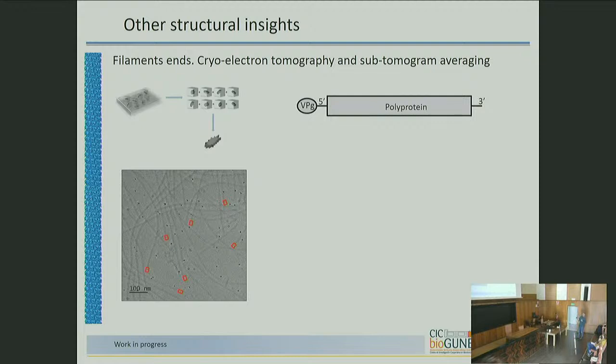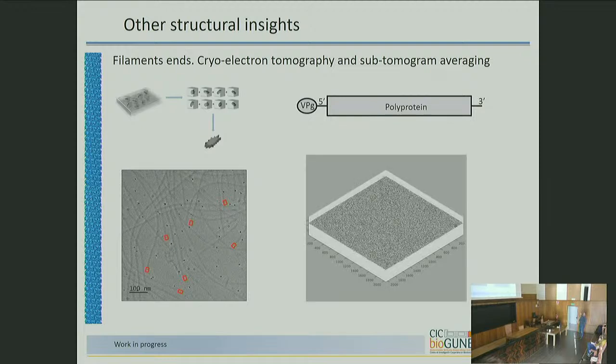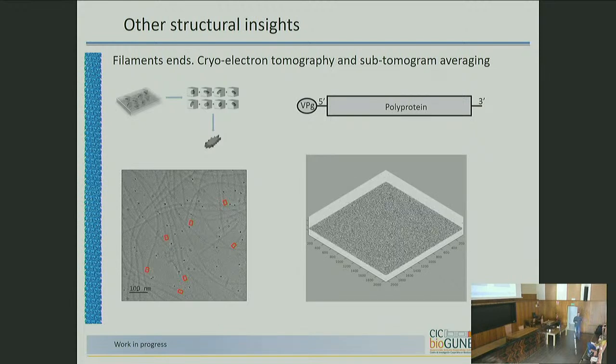This is one of the images of the tilt series. The idea is to select the ends of those viruses. When we calculate the tomogram, this is just different sections at the end of the tomogram. You can see that the gold particles that we were using for alignment, which are fiducial marks, are removed before going to the tomogram.